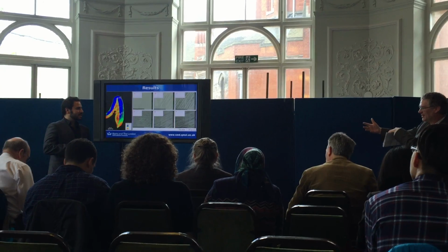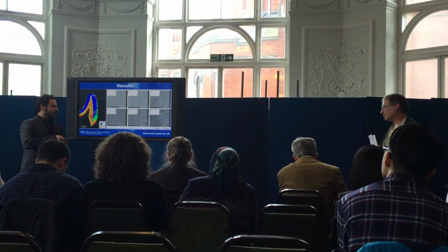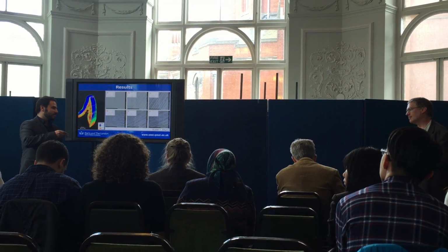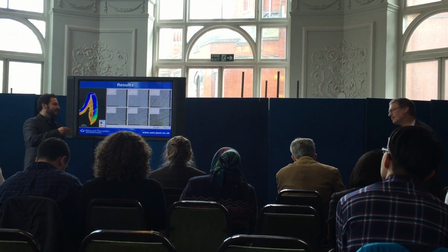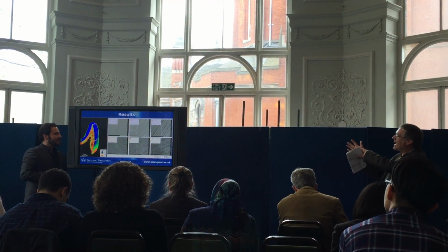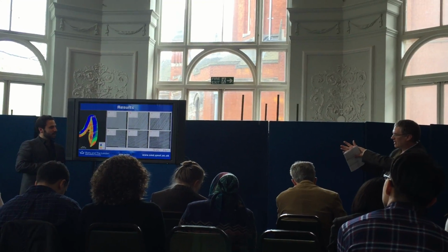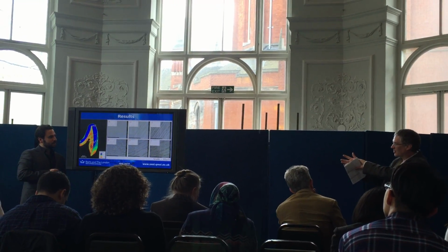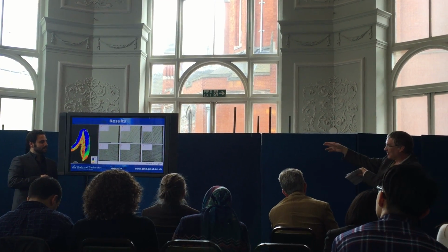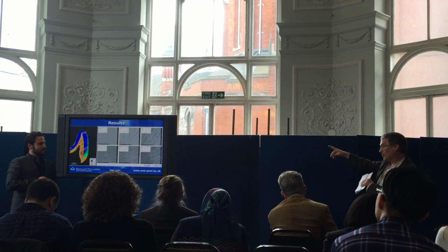Well, the prism boundary is where we have the interprismatic enamel, and in a way you have a keyhole structure, which defines this boundary. The prism boundary is actually a change in direction of crystals, so in a sense you can actually measure that change in direction.